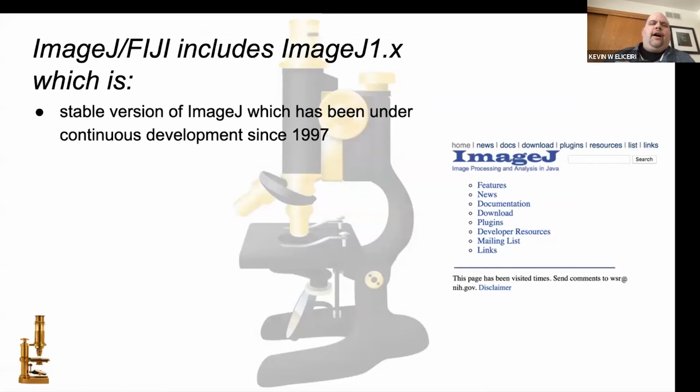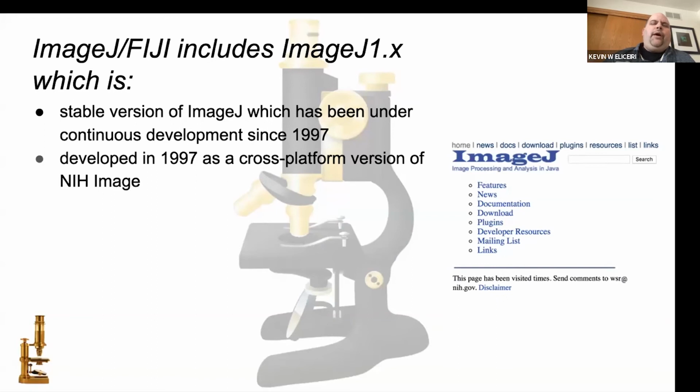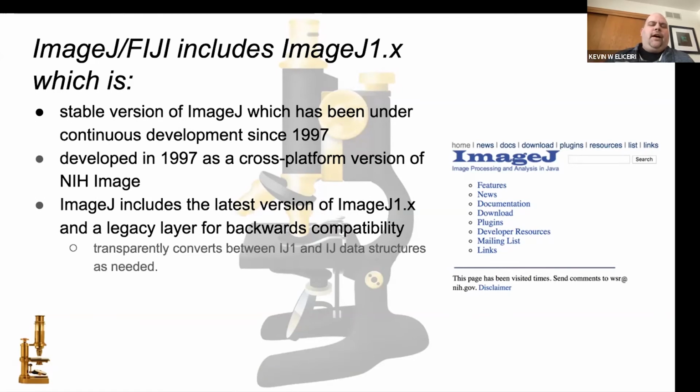And the neat thing about Fiji is that we did something quite controversial at the time, which gets to Vlad's point about building pipelines and supporting users: we didn't want to break anything. So the version that Fiji uses now includes all the backwards support for ImageJ 1. I remember the reviewers were quite upset about the grant we submitted for that, because it took us almost 1.5 years to add that support and make it work well. It was important to us because we didn't want to fork or break the community. We wanted to make sure that if you use Fiji and you really like ImageJ 1, you still can.